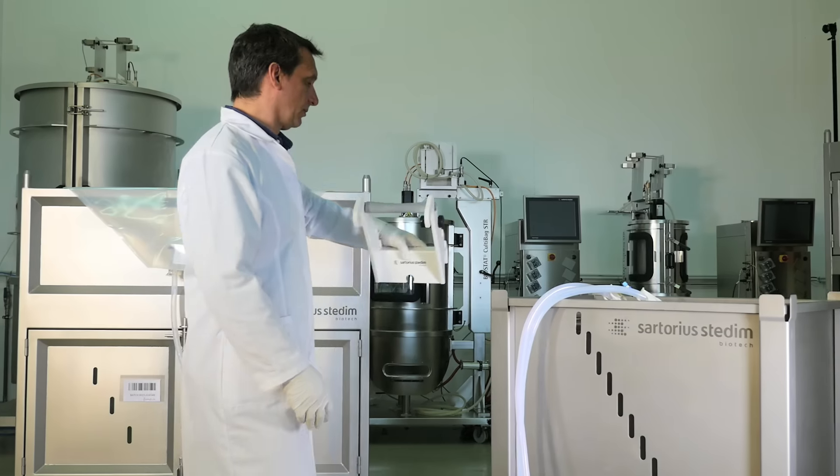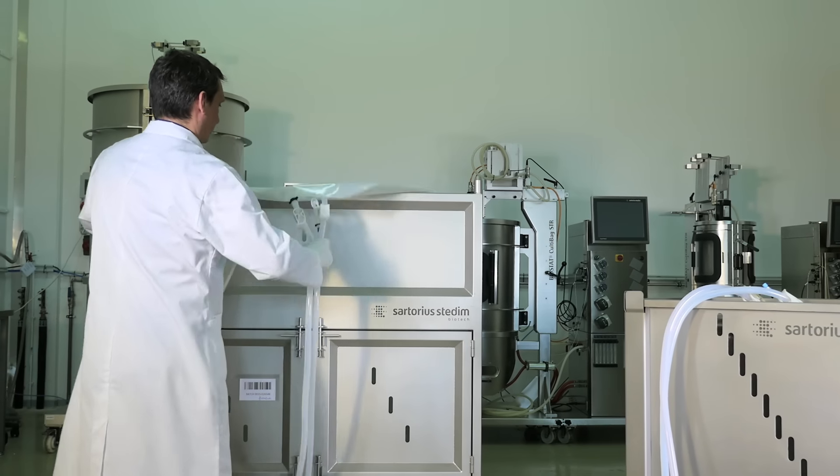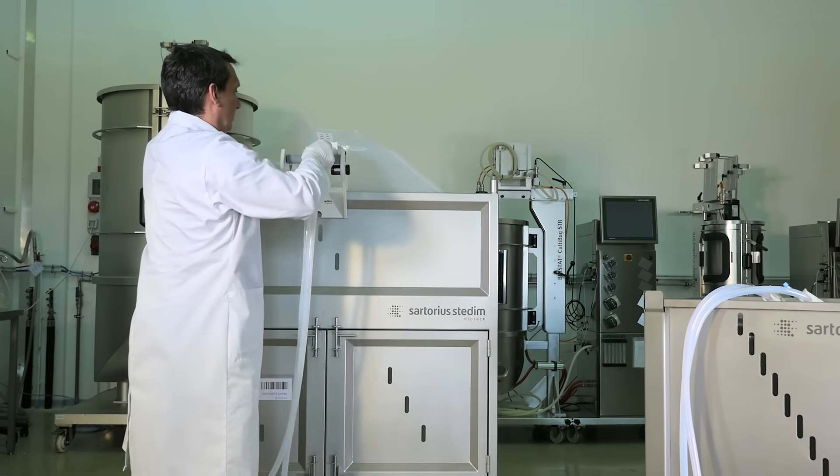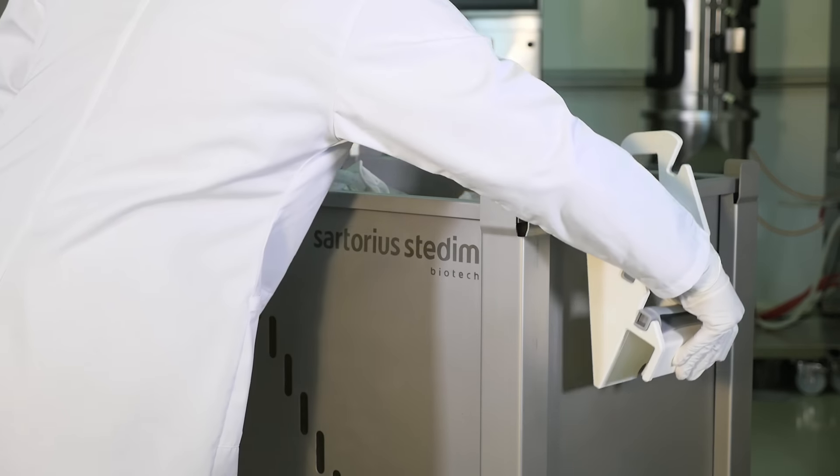The self-deploying accessory is compatible with the pallet tank for storage and for in-process fluid handling from 100 liters to 1000 liters.